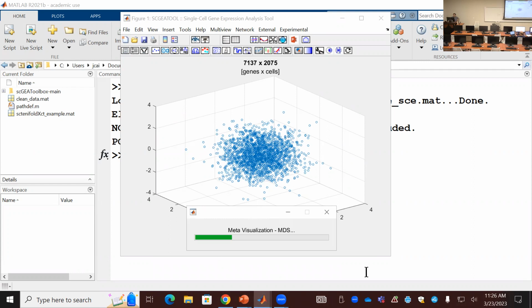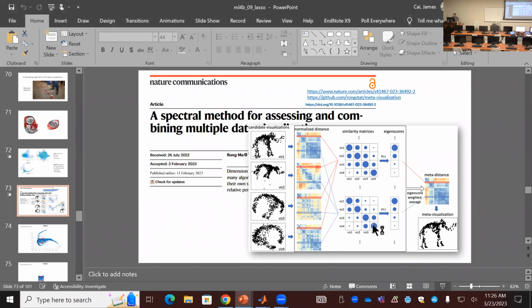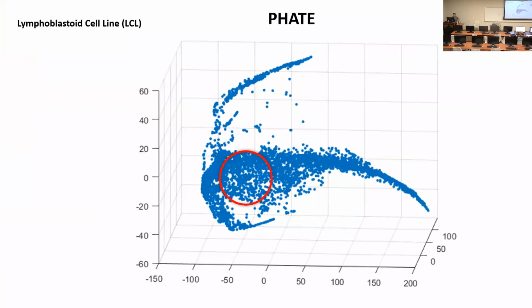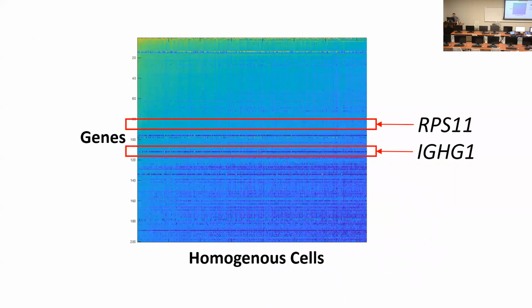Yeah, I will come back to this once it's finished, but I just let you know it's available in there. Okay, so we select cells that are only in this, what I call the stem region of this center of fate. I believe this is a highly homogeneous population of cells already.